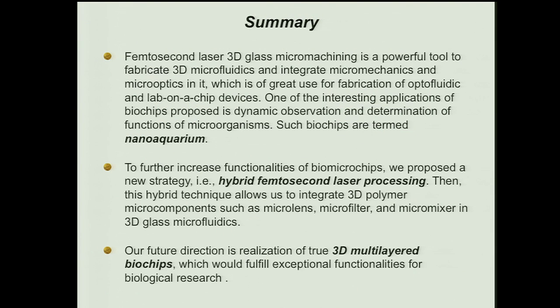Okay, so here I summarize my talk. Femtosecond laser three-dimensional glass micromachining is a powerful tool to fabricate three-dimensional microfluidics and integrate micromechanics and micro-optics. And this technique is of great use for fabrication of optofluidic and lab-on-a-chip devices. One of the interesting applications of the biochips we proposed is the dynamic observation and determination of the function of microorganisms. Such biochips for the study of microorganisms are termed nanoaquarium.